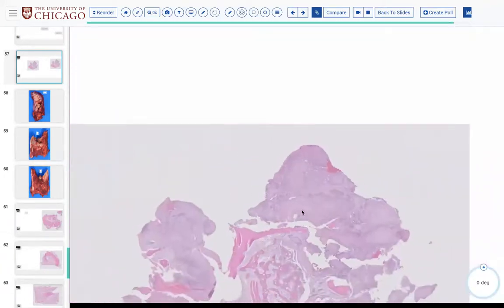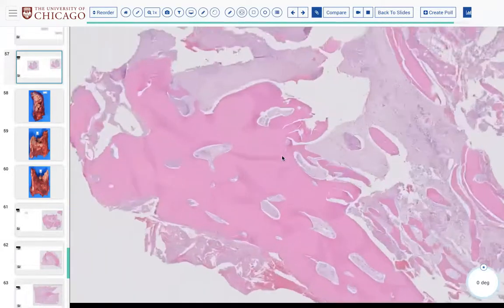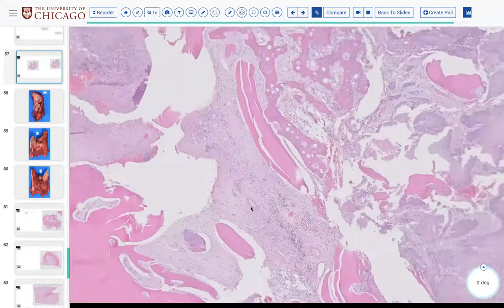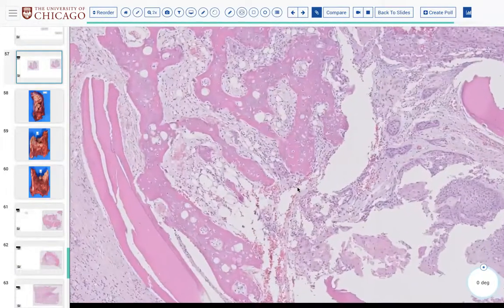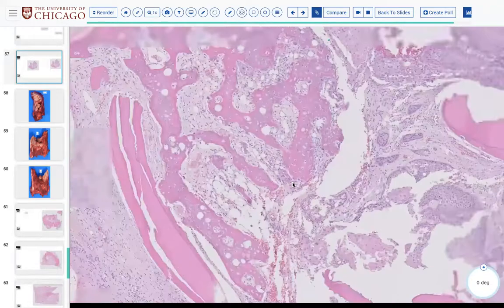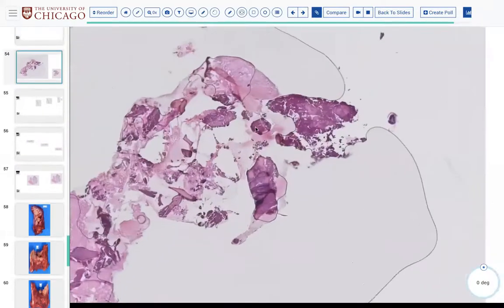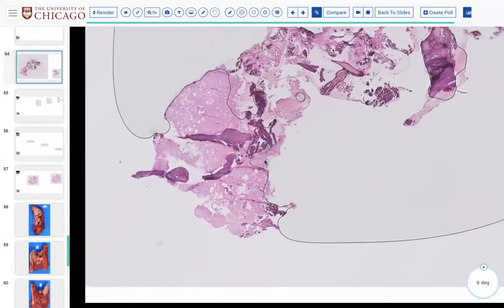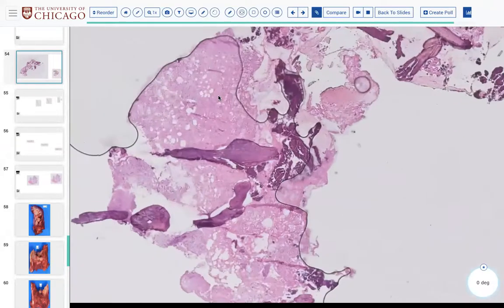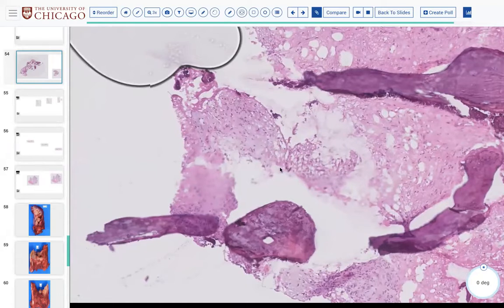And she flopped this from the mandible. Here's a little bit more cortex, certainly that would not freeze. But this kind of woven bone with tumor, that kind of stuff theoretically could cut. It just wasn't sent to you. What was sent to you was much less representative of the actual face of that mandible. You got mostly bone and fibrous tissue with a tiny little speck.